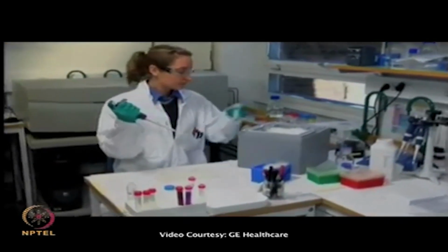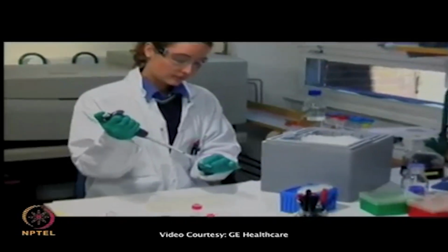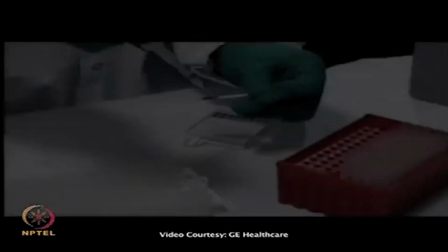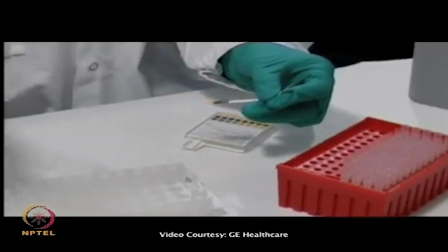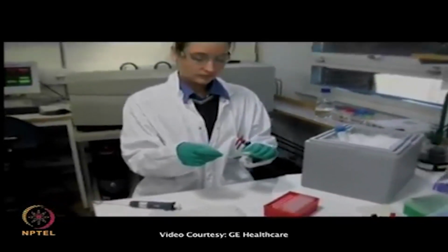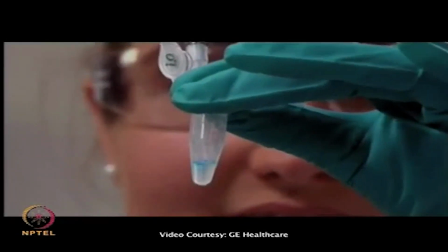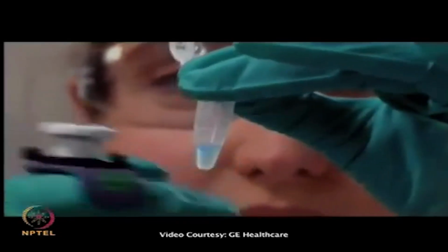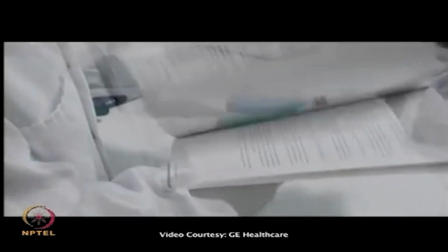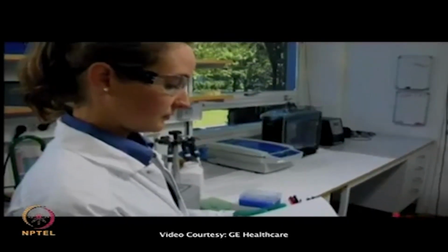After the wash, the cell pellet is resuspended in 200 microliters ice-cold labeling buffer containing HBSS pH 8.5 and 1 molar urea for optimal labeling conditions of cell surface proteins. Always check pH before labeling. We used 600 picomoles Cy-dye for 10 million CHO cells. The optimal ratio of Cy-dye to cell number will vary depending on the cell type, since we do not know the exact protein concentrations on the cell surface. How to determine the optimal conditions for Cy-dye labeling of proteins is described in the 2D Electrophoresis Principles and Methods Handbook.